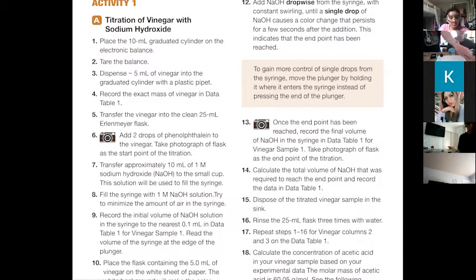And we're going to add 2 drops of the indicator. This is the indicator here. Now that will change color when the pH goes up. Yeah, if you get 3 drops, that's not a problem. There you go. Then swirl it around, get it all mixed up. So because this is acidic, is the pH going to be low or high? You remember? Pretty low. Yeah. And when the pH goes up, it'll change color.